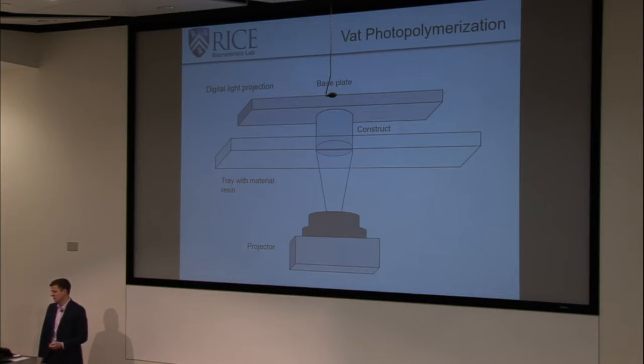Thank you. So just for the recording's sake, for encouraging PEG-DA to adhere to a base plate, your lab does indeed use what we'd call the burn-in layer, increasing the exposure time for those first few layers from 8 seconds to 30 seconds, which ensures that it sticks to the base plate. Cool. Thank you.